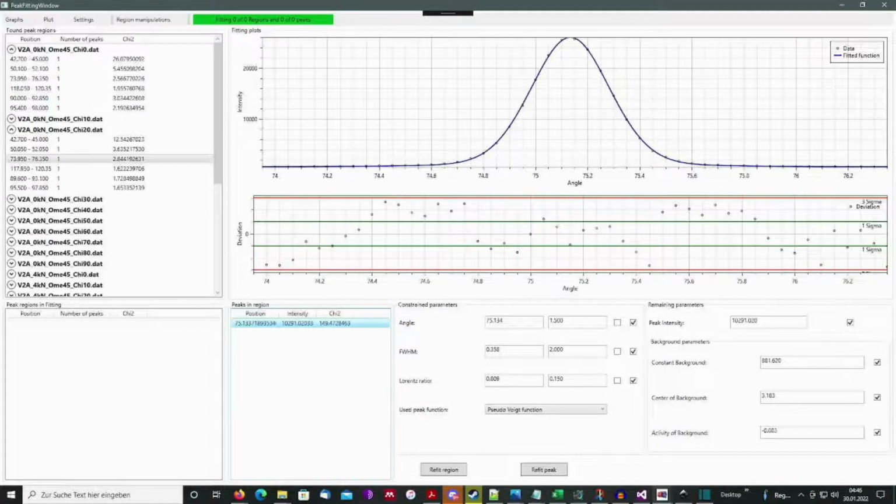Now we arrived at the last part, which contains the region manipulation. To change the region, 2 steps are necessary. First, the desired action is selected from splitting the region, reselecting fitting data and insert peak. We will select the second one.